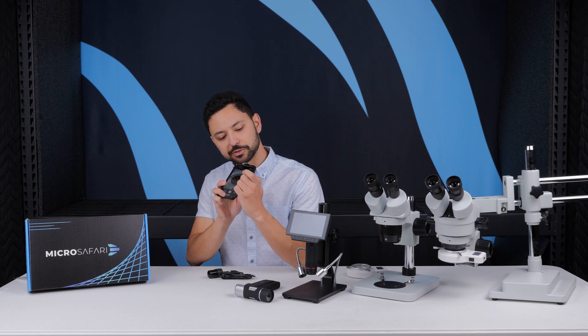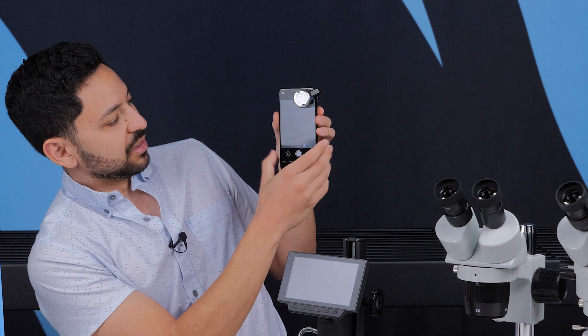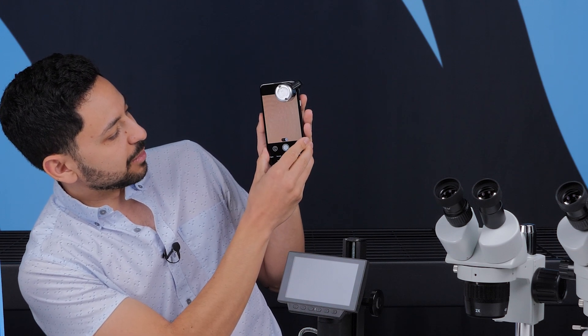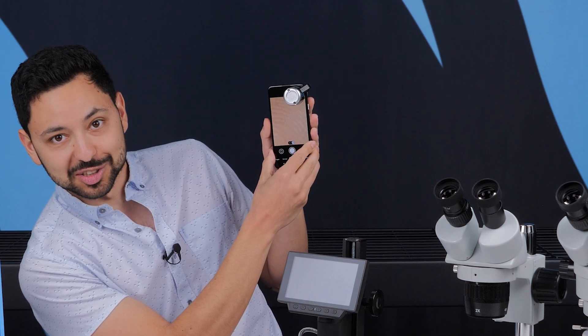Really simple to use—you just put it over your camera. Boom, like that. You can see on my phone. Pinch to zoom, and then you just put it up to whatever surface you're looking at. In this case I'm looking at my fingerprint, and it just instantly works. It looks great.